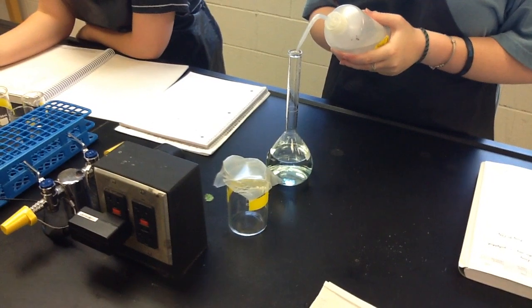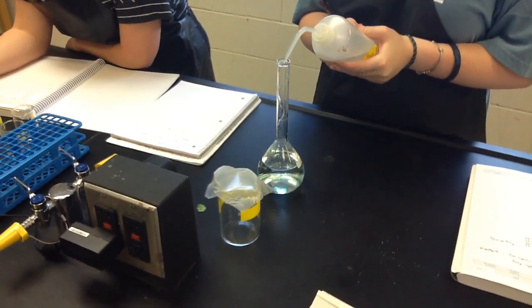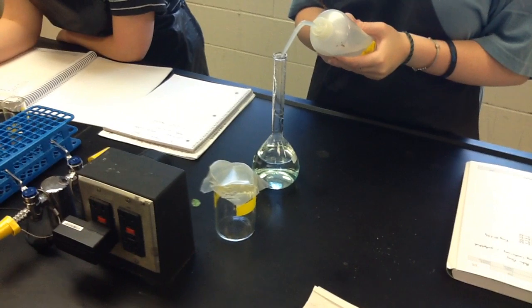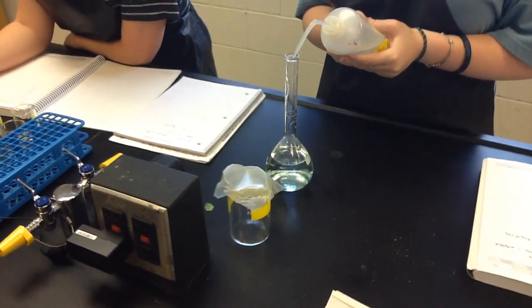Okay? This is our unknown. Okay? When we do our calculations and look at the graph, that's going to give us the molarity of our solution. And now if we know the volume, that gives us all the information we need to be able to calculate the mass percent.